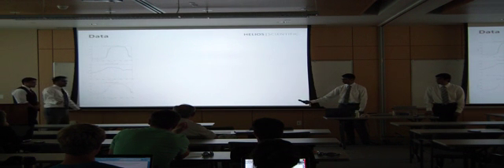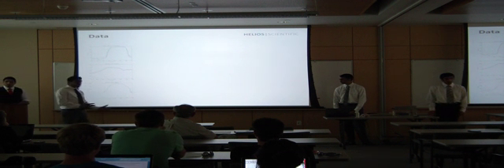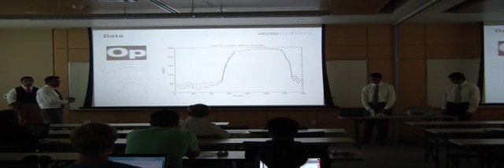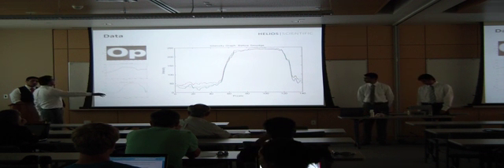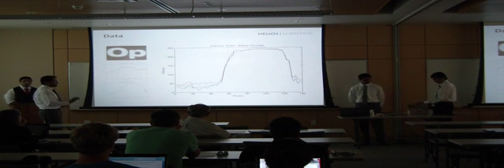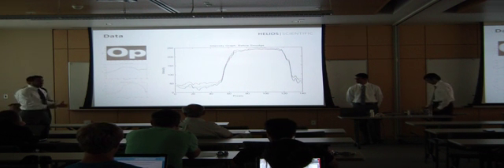So as Parag mentioned, we used some code, and what we wanted to see is the sharpness of the image. And the way we did that was we took each image and looked at the intensity across a certain line across the image. So as you can see, this is the picture for no smudge. So this is just the lens itself, no smudging, no treatment, nothing. And by the way, this is just the no-PEG slide. So just think that with PEG on the slide, the results would be a lot greater.